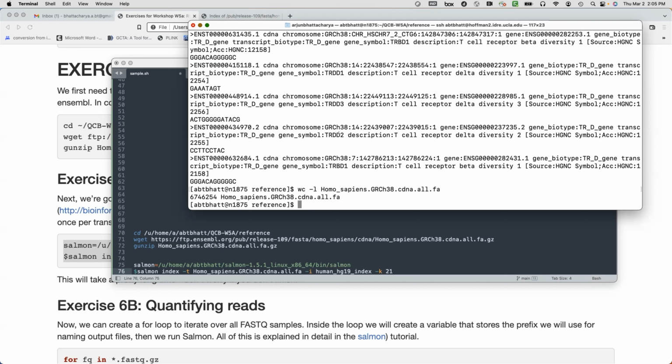At the same time, we can use a small subset of samples to build up a transcriptome assembly, update a GTF file, or update our cDNA library, and then use this library to quantify short read RNA sequencing data using Salmon for a larger number of samples. So does that make sense?